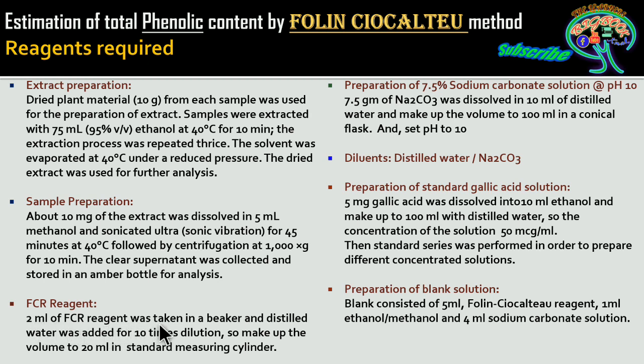Now further we are going to prepare the FCR reagent. 2 ml of FCR reagent was taken in a beaker and distilled water was added for 10 times dilution. Take the 2 ml and make up the volume to 20 ml, so there will be the 10 times dilution.